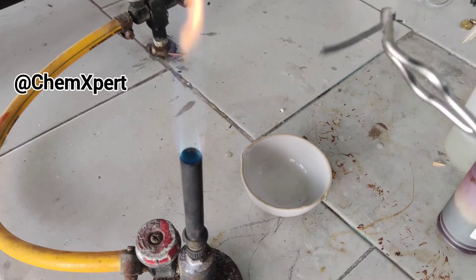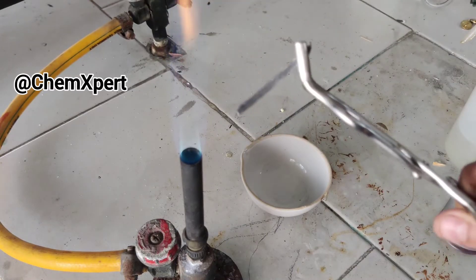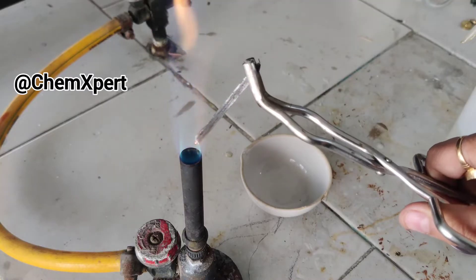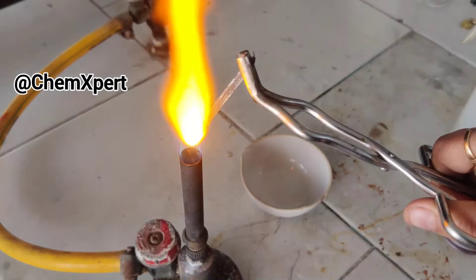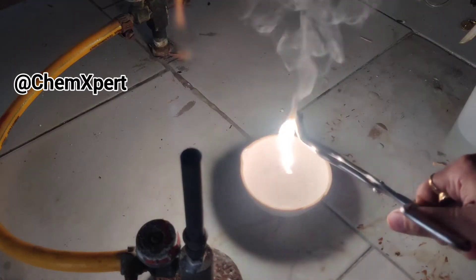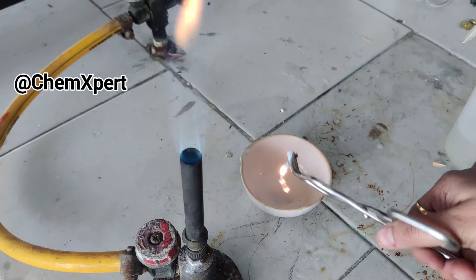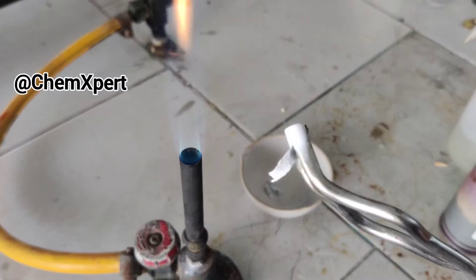In the first part of this activity, I have taken the magnesium ribbon and will heat it over the Bunsen flame to collect its ash. Magnesium reacts with oxygen and forms magnesium oxide. It produces a white dazzling flame, and you can observe a white color ash is formed.